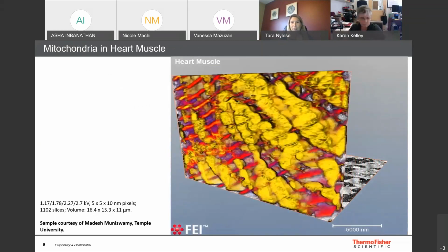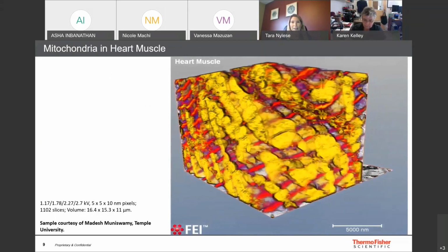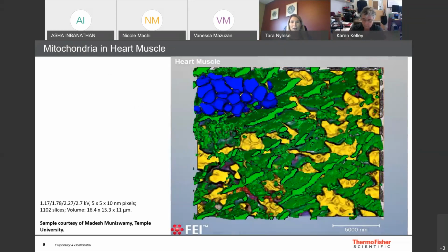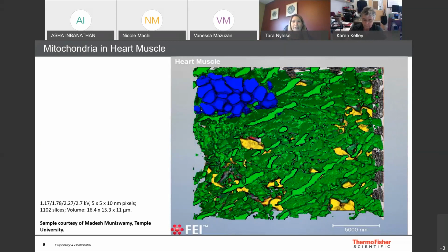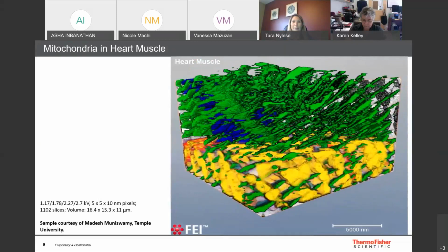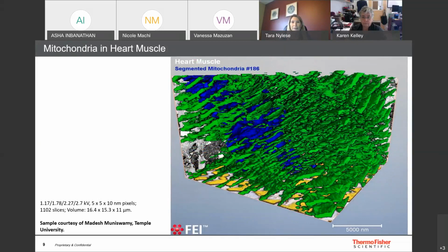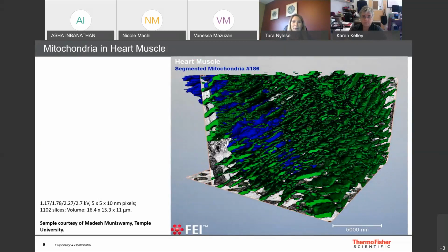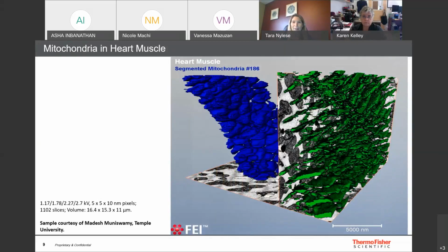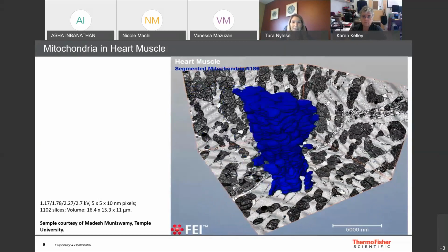And when we collect that volume or sequential sections of images, we could then render them into 3D space. And then we render that block, or volume rendering. And we could select certain features. So for example, if we wanted to select only the mitochondria, we would segment them in blue using a data visualization package. And then we can keep sectioning visually through the image analysis package so that we remove all the material that we're not interested in.